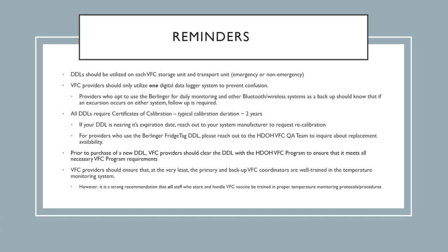For our VFC providers here in Hawaii who use the Berlinger Fridge-Tag DDL, before you purchase, you can go ahead and reach out to our QA team to see if we have any replacement availability for you folks. However, that is contingent on funding. We do want to remind you that prior to purchasing a new DDL, providers should clear the DDL with our team to ensure that it meets all necessary VFC program requirements. We want to make sure that it's suitable for use before you go ahead and make that purchase and end up having to return it, or if you can't return it, that's going to be lost to you.